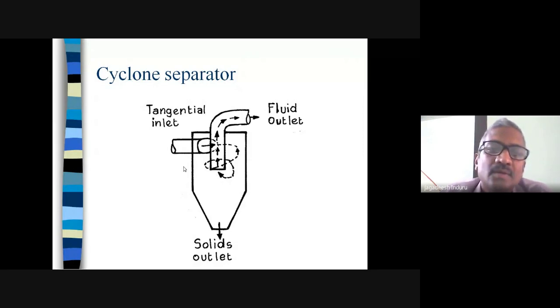We know the centrifugal effect is directly proportional to the mass. Whatever powder has more mass will go to the periphery. Whatever powder has very little mass will be present in the center. So the centrifugal effect is greater with more mass. That is the reason the materials which are heavy in nature are pushed towards the periphery, and they come near the wall of the cylinder.